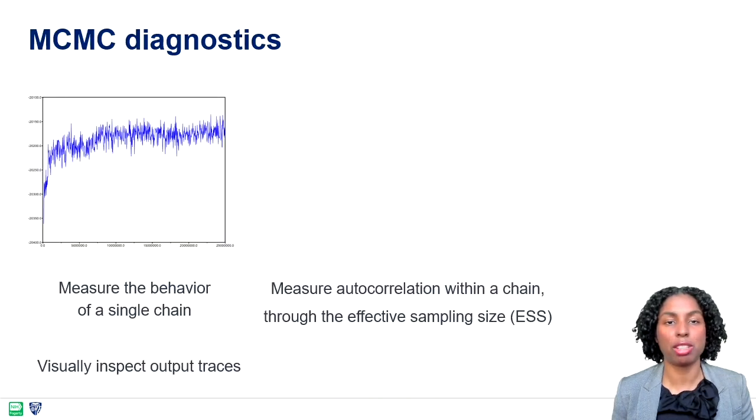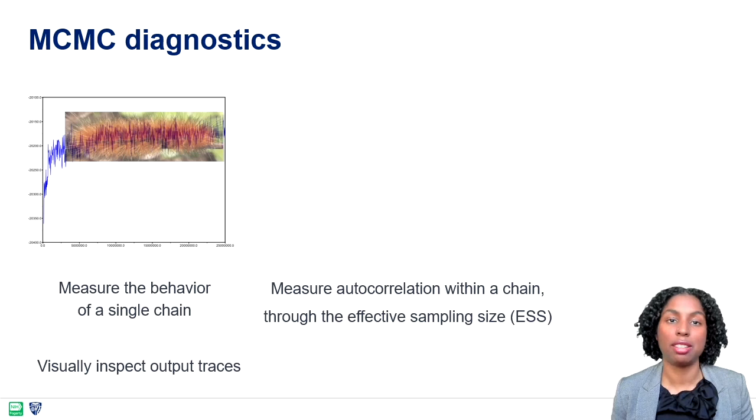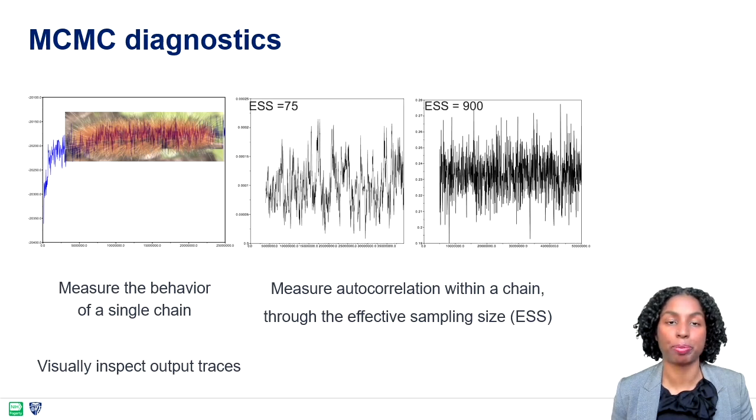Tracer is also an MCMC diagnostics tool. An acceptable chain should look like white noise or a hairy caterpillar, since that represents that the MCMC appropriately explored the posterior probability landscape without getting stuck in local maximums. The effective sample size, or ESS, is the number of independent draws from the posterior distribution that the MCMC chain is equivalent to. The ESSs are calculated as the number of samples divided by the autocorrelation time, or ACT.